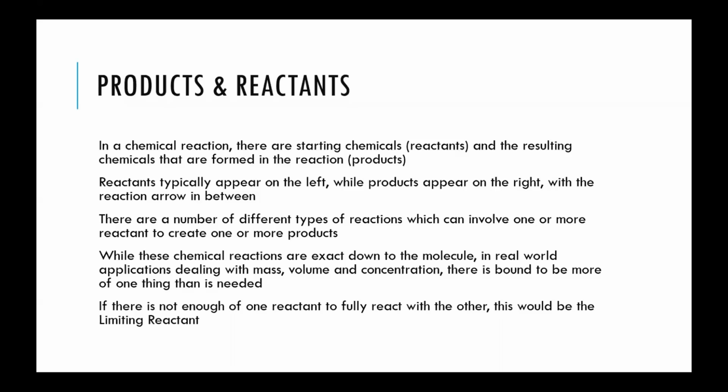And in a lab setting, you can't get these amounts down to the actual molecule. You can only deal with what you have in front of you, and that's weighing things out on a scale or a balance, or looking at volumes and masses.